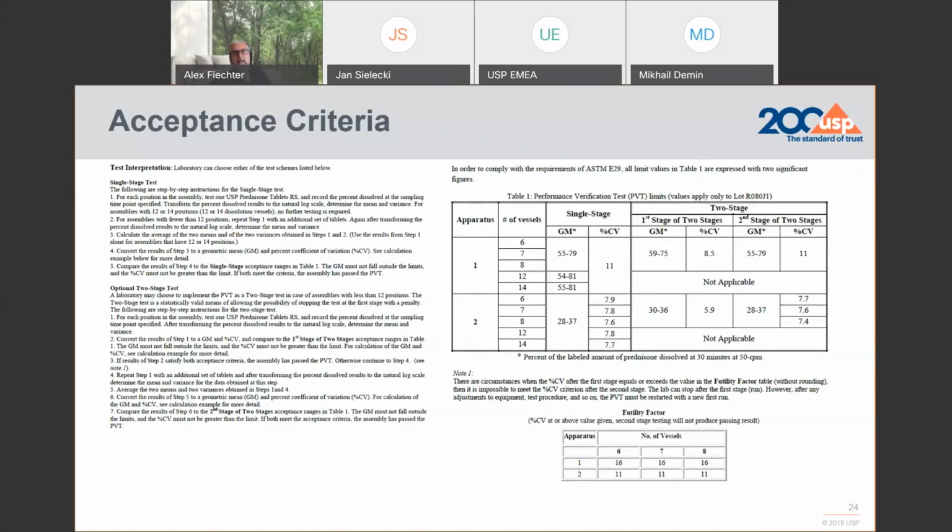Single stage means for a 6, 7, or 8 position test assembly, you do one test with 6, 7, or 8 tablets, and you do a consecutive test of again 6, 7, or 8 tablets, and statistically calculate the geometric mean and percentage CV based out of these 12, 14, or 16 test results.